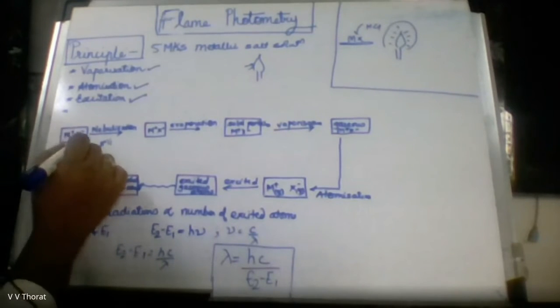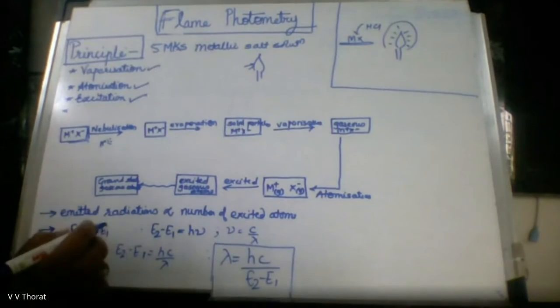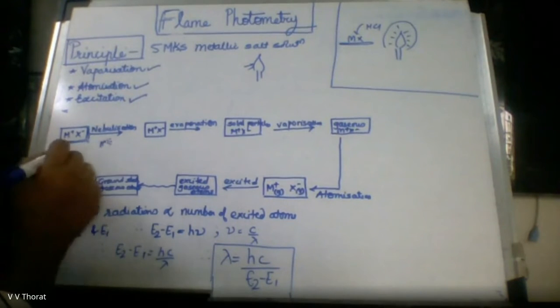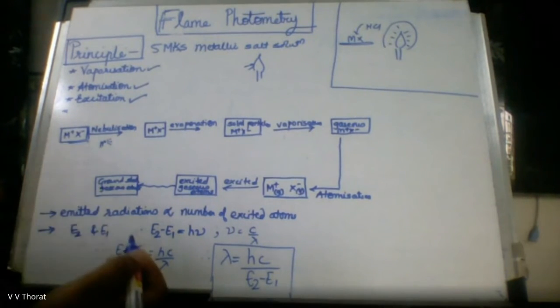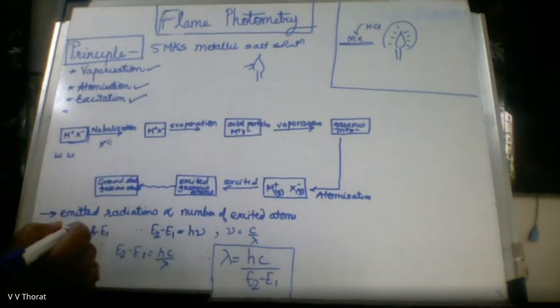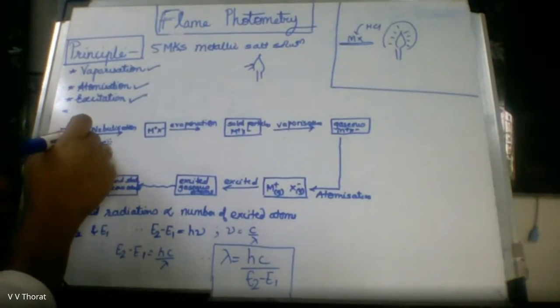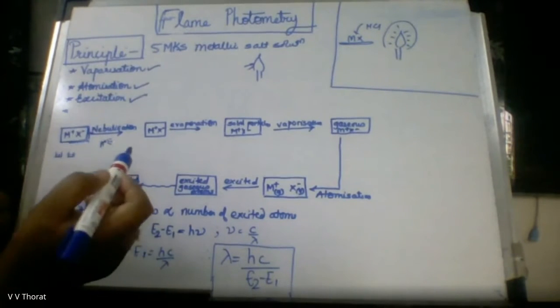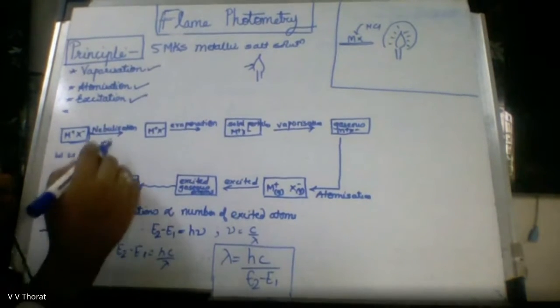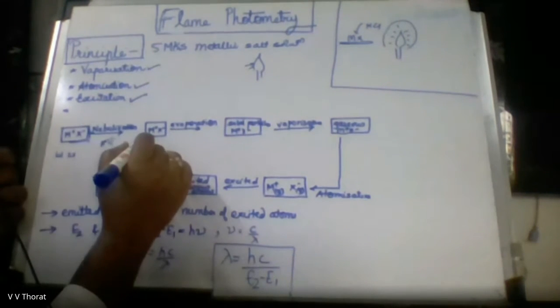So now let's see in a tabular form. This is a metallic salt solution which you have prepared. We have seen it in the video. You can dissolve it in HCl. But there, in the video, she had taken all chloride forms. Therefore, those solutions were made in aqueous solution. Otherwise, in our lab, we add HCl and then you spray, aspirate. Meaning, you spray it in, convert it into spray. So you will get fine drops or you will get mist of the salt solution.